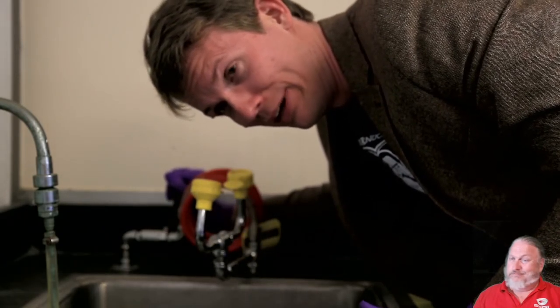I've actually never done this so this will be a new experience for me. It does not feel particularly pleasant but it's better than having your eyes burned out. Do not eat or drink in the lab. Despite our best efforts, stuff does sometimes get where we don't want it to be, and if it gets in your food or you accidentally pick up the wrong cup, that's just a really embarrassing story for your obituary. Also I would generally suggest avoiding working alone in a lab, especially if you're working with any machinery or hazardous substances, but it will be up to you and your advisors to make that decision when the time comes.